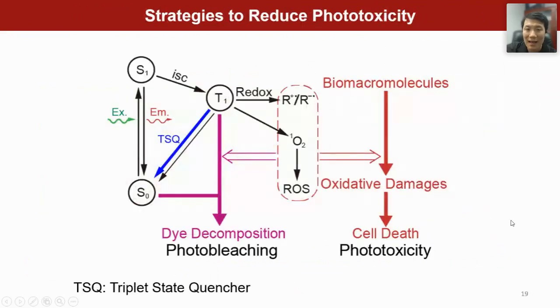So yeah, that's basically the story about PK Mito. We basically highlighted how simply by conjugating cyclooctatetraene, we can effectively deplete triplet states and inhibit all these ROS and use this concept to alleviate the phototoxicity. And I think we are the first group to demonstrate this concept of alleviated phototoxicity using chemical approaches inside live cells.